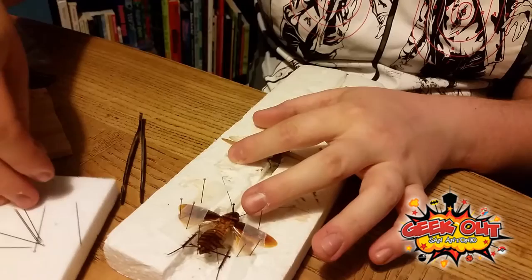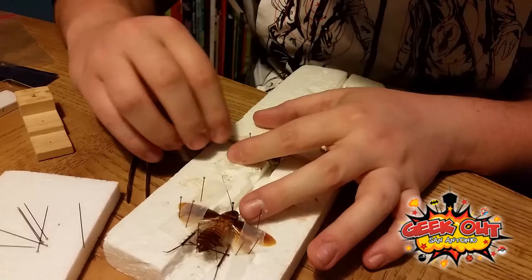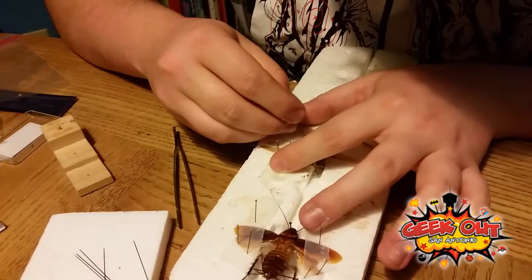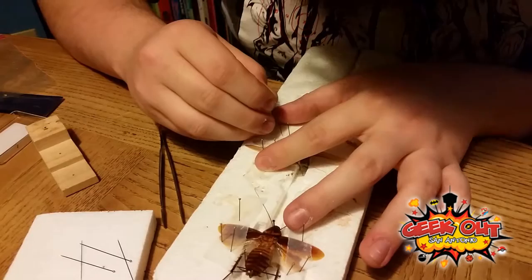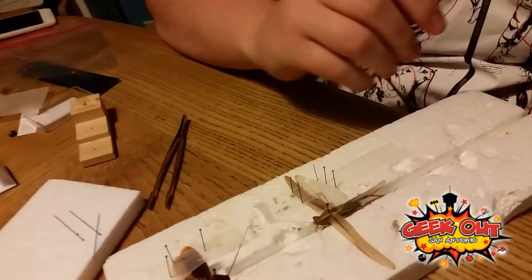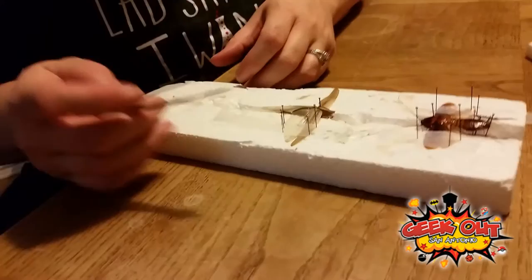It's the exact same process, except this time I'm probably going to use more pins because the wings are longer. So I would do two at the top, three at the bottom, one on each side of this. And then just in every little kind of nook and cranny in the bottom, you want to just put one on each side, and then one right in the middle. And again, not pinning through the wing — you can pin through the wing, but you want to make sure you're very careful. So we're going to switch again and I'm going to try the other side.